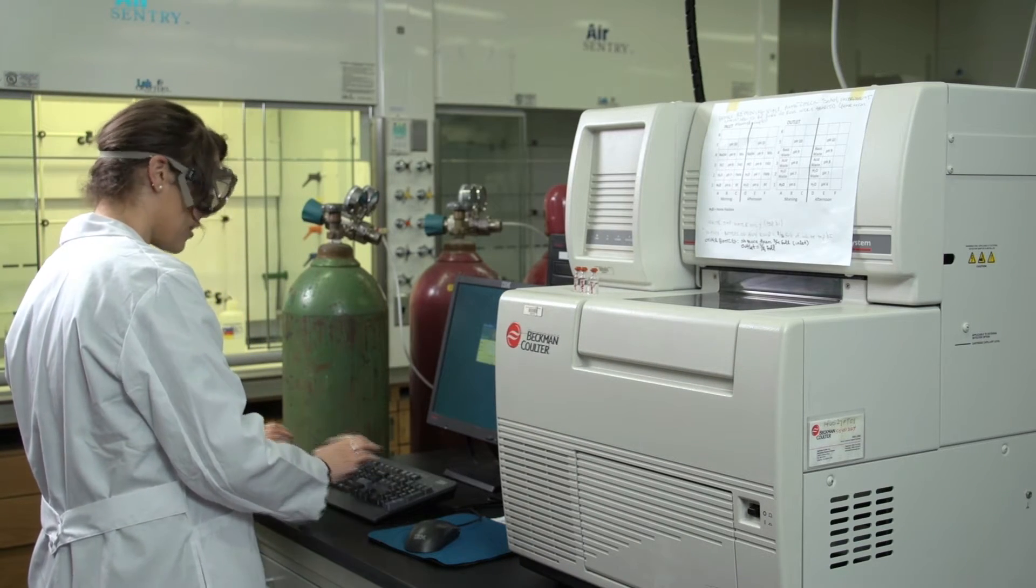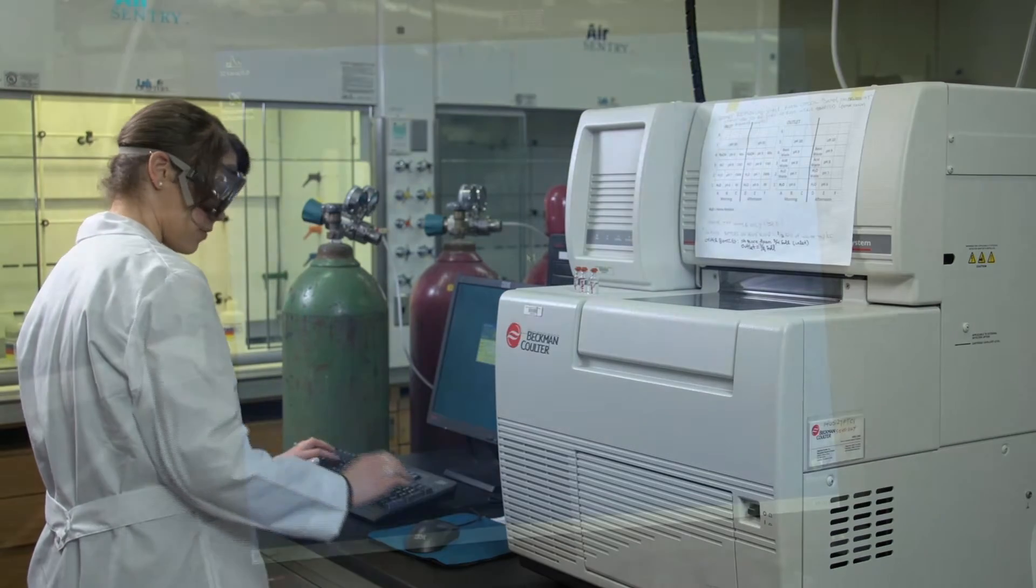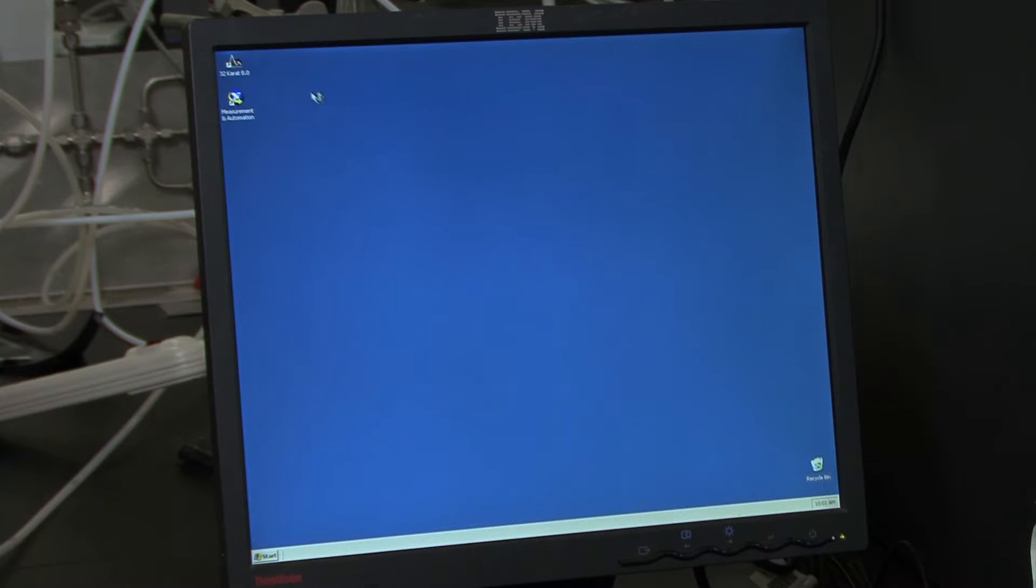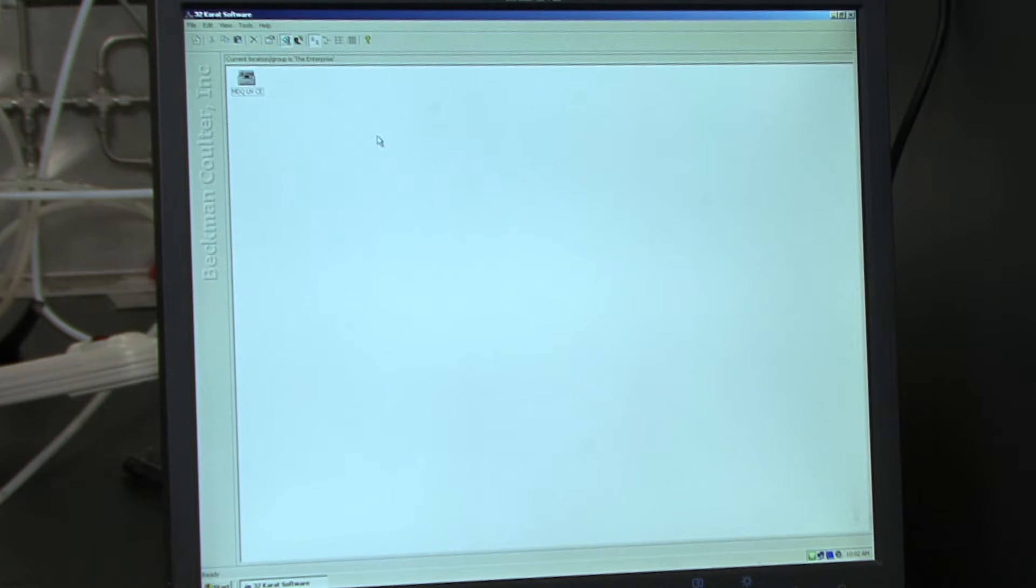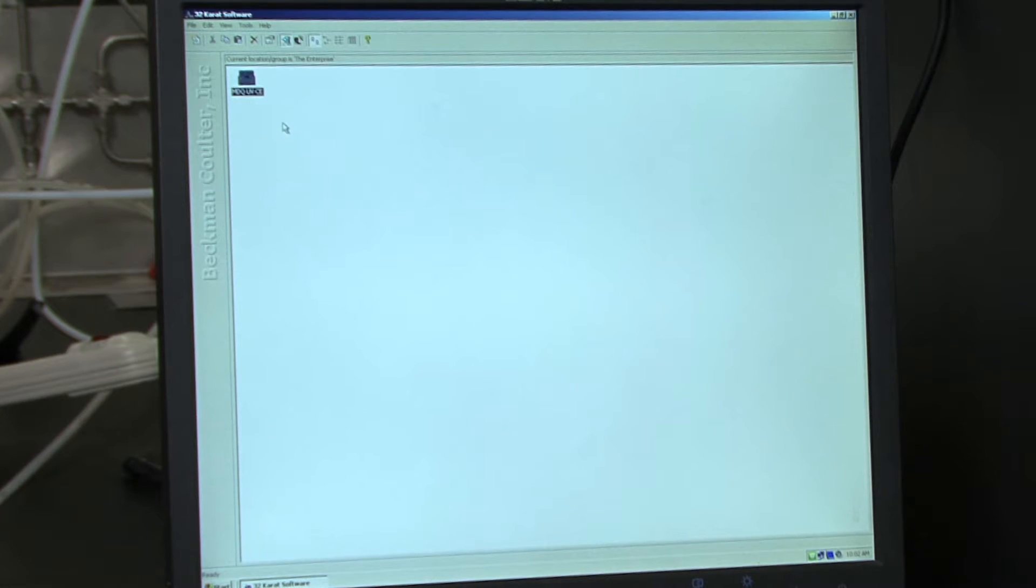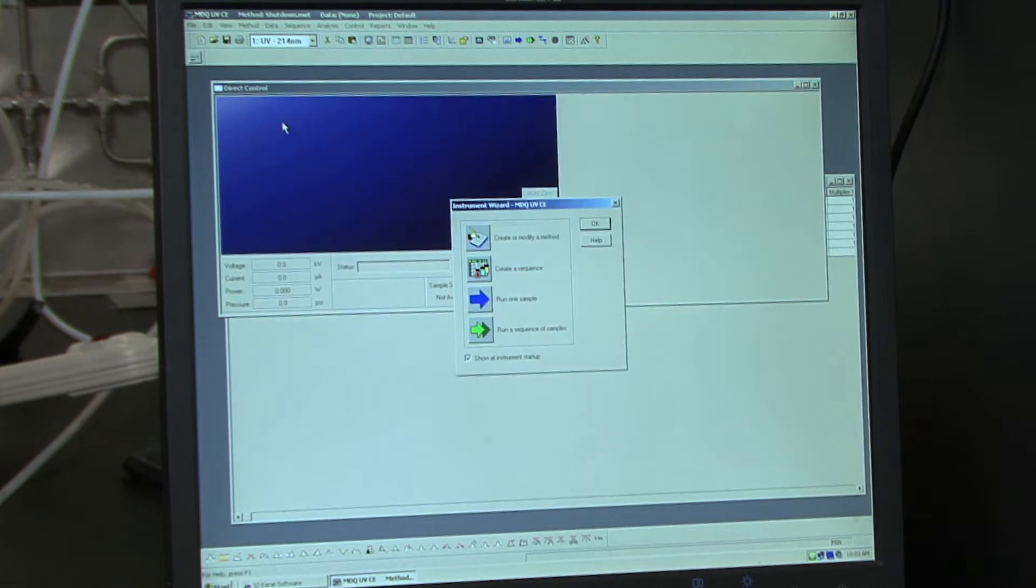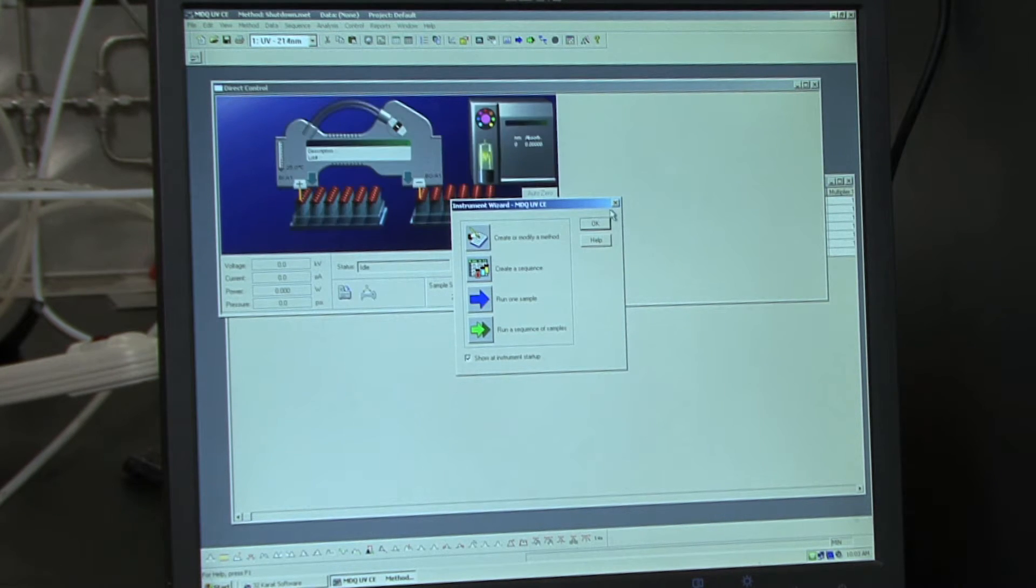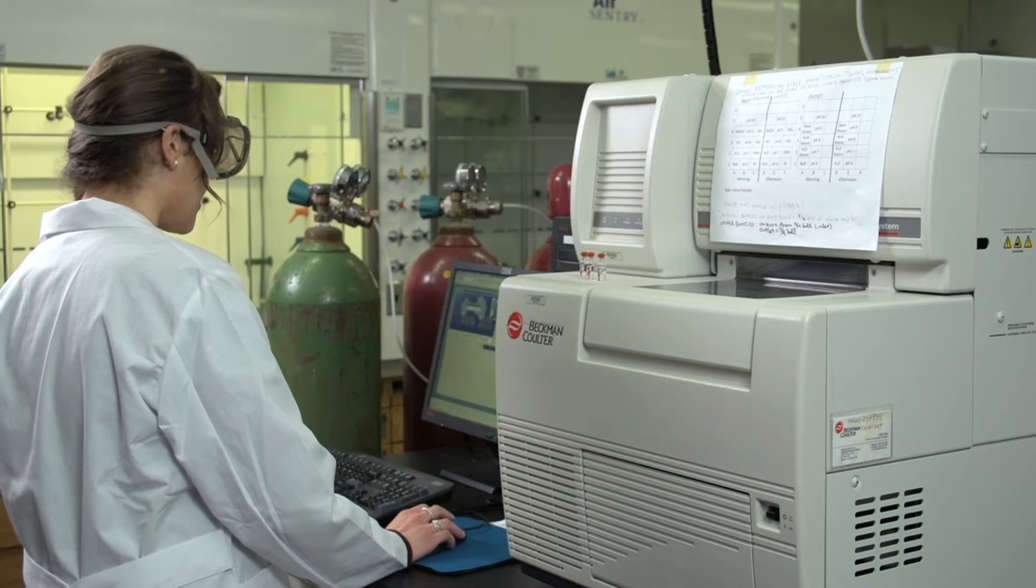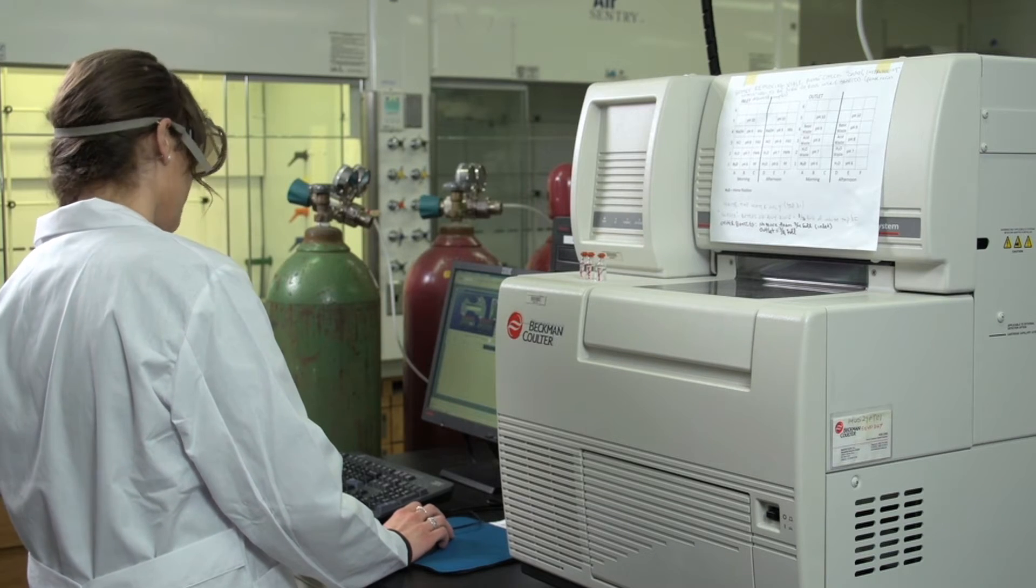So you need to log in. Once you're logged in, you can click on the 32 Karat icon. Once the software is open, you can click on the CE icon. You can click exit out of this.